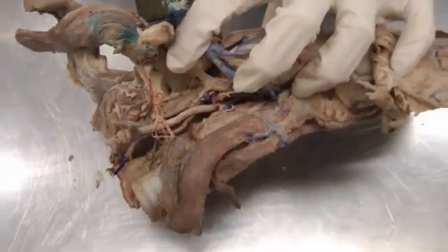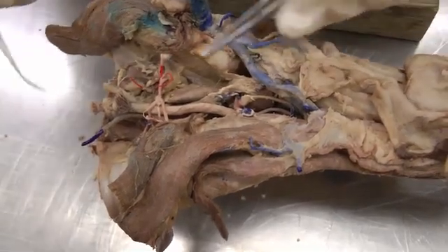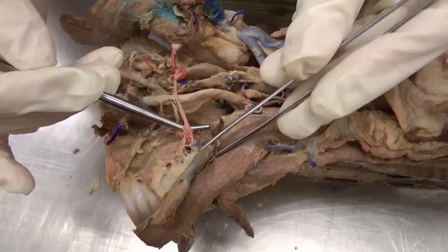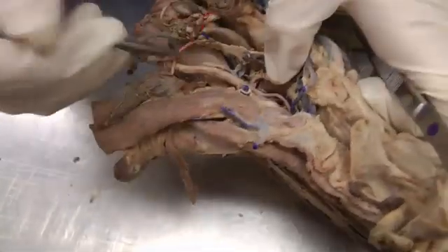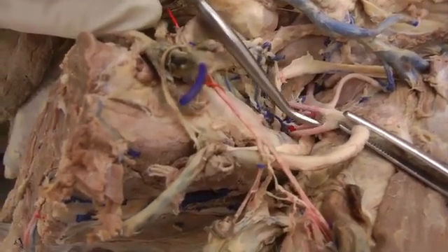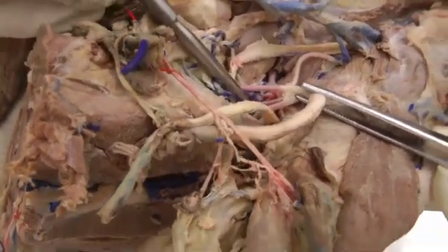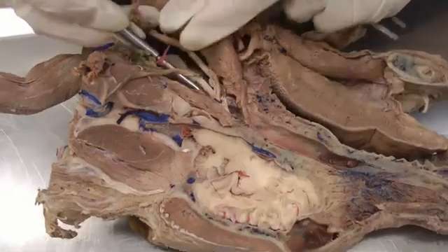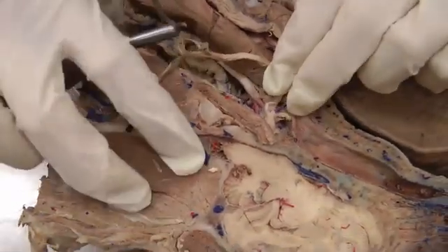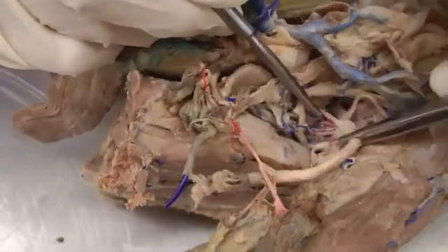Now on to the common carotid artery. If you have one side injected better than the other you can use that side. Here we have a cranial thyroid artery — our thyroid is down here. As we follow the common carotid up towards the head, internal carotid should be this one and has a slight enlargement at the base — that should be the carotid sinus. Some animals will have a really nice one, but just enlarged at the base is the carotid sinus, and this is internal carotid. The other part going the other direction is all external carotid.